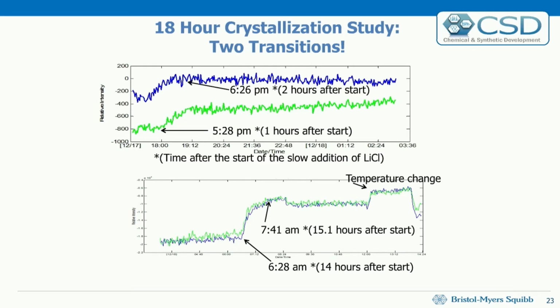If you wait till about 14 hours later, you come in early the next morning after starting it late in the day, you might have a mixture, and that's what the chemist saw. If they come in later in the day, let's say 10, 11 o'clock, they're already 16, 17, 18 hours after they started it, they have a second form. So this is a way we could do this without monitoring constantly for 24 or 48 hours: put the probe in, or do non-contact right through a vial, let it stir, watch the crystallization, walk away, and come back with your data, process it later, and note that you have changes.